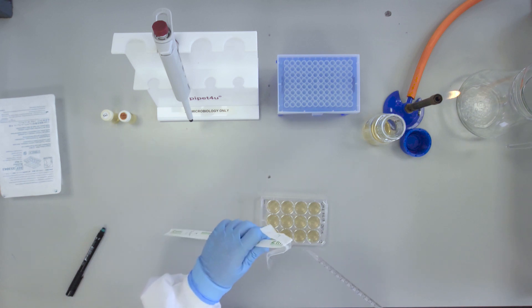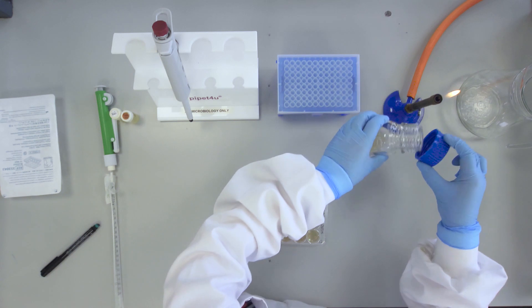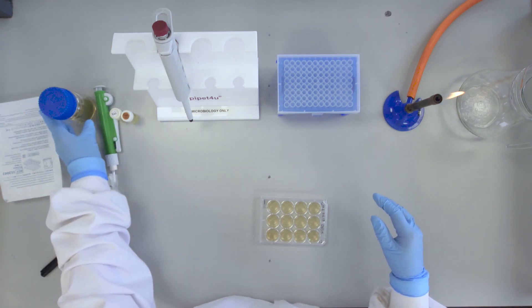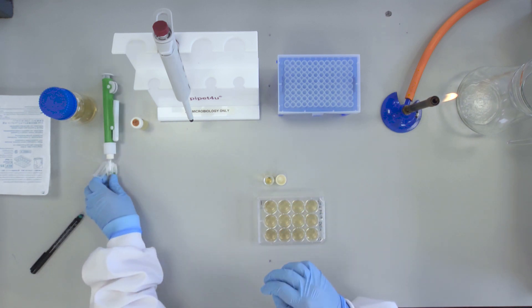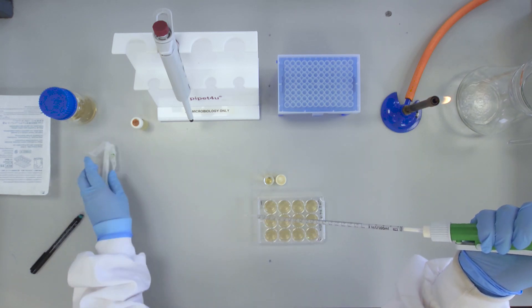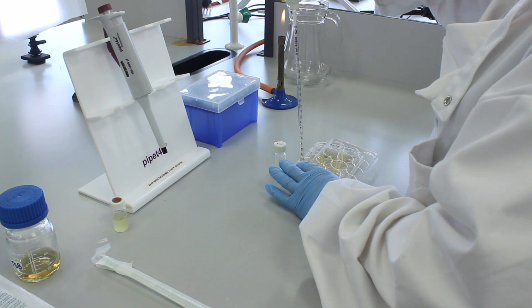Replace the pipette in its wrapper after use. You will now carry out doubling dilutions of the nalidixic acid by transferring 2ml of the 2048 microgram per ml nalidixic acid solution from the Bijou labelled NAL to well number 1 using the 2ml pipette. Mix the well contents by pipetting the liquid up and down with your 2ml pipette.